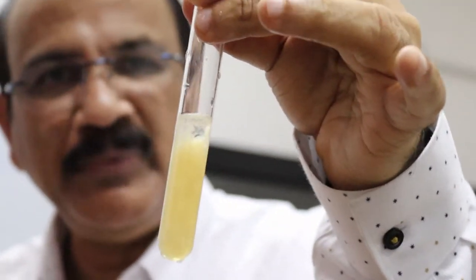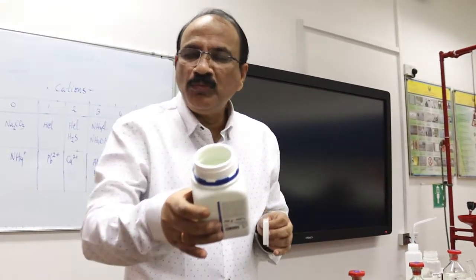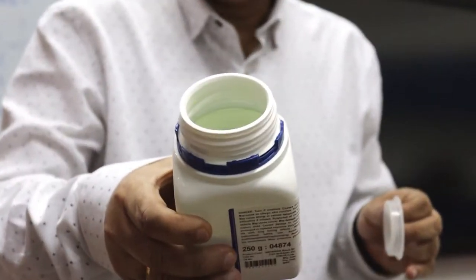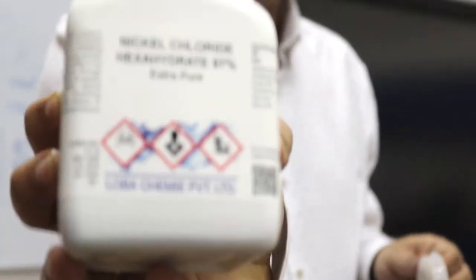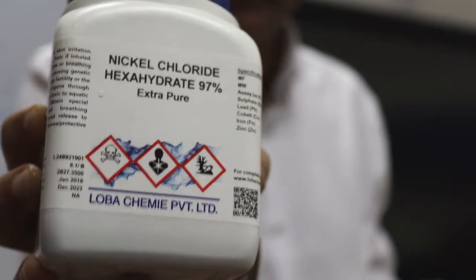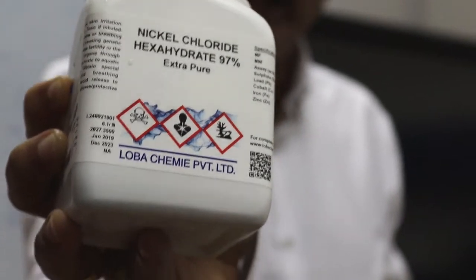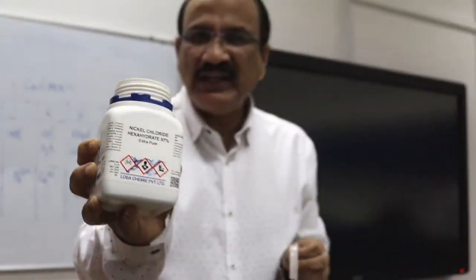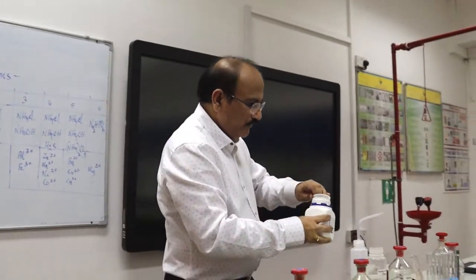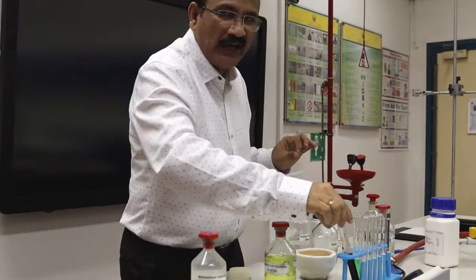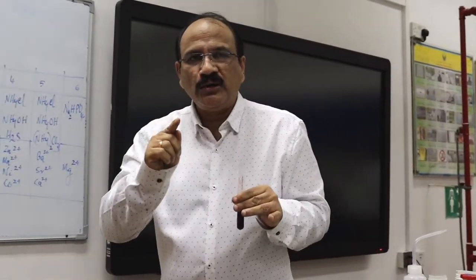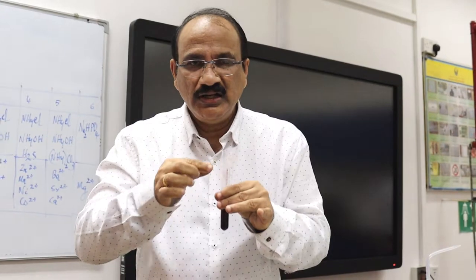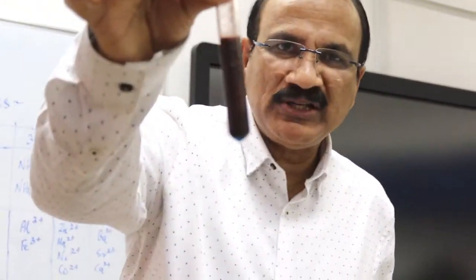This is the confirmatory test for Mn2+. We have one more cation in the fourth group — it is nickel, Ni2+. Using nickel chloride, we perform the group analysis by adding the group reagents: ammonium chloride, ammonium hydroxide, and hydrogen sulfide. We get a black precipitate, which indicates the presence of Ni2+.